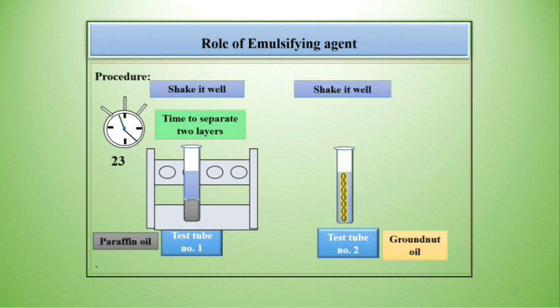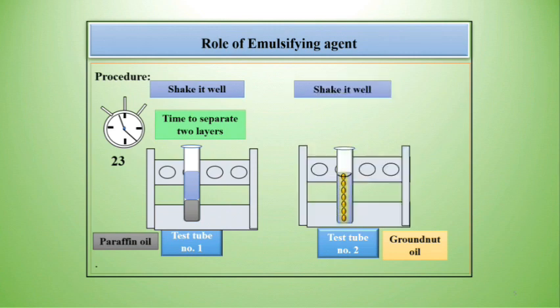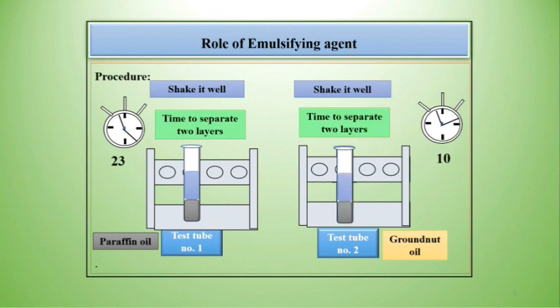Similarly, shake well test tube number 2 and keep it in the test tube stand. Then watch this test tube. Start the stopwatch and record the time required to separate the 2 layers of water and oil in test tube number 2.